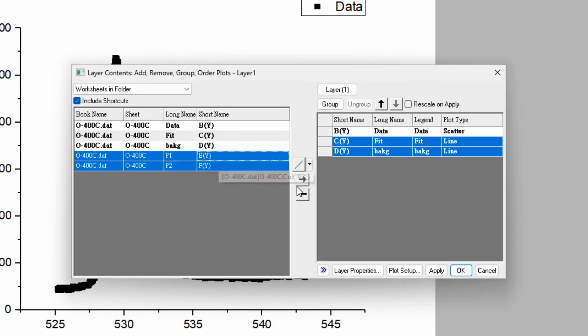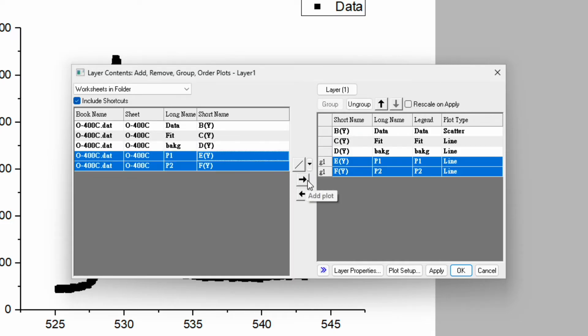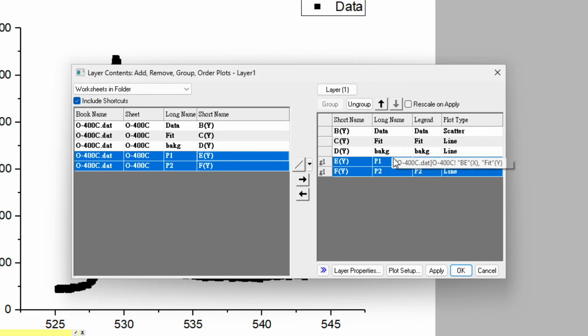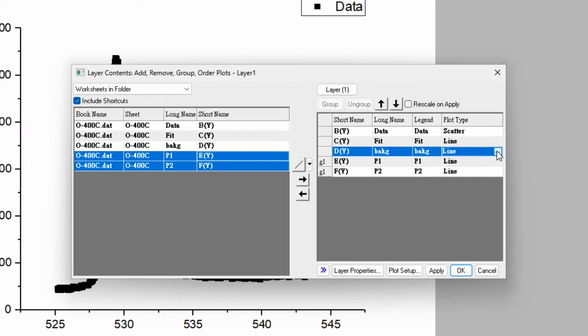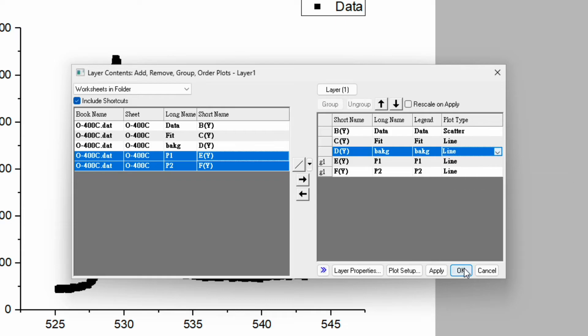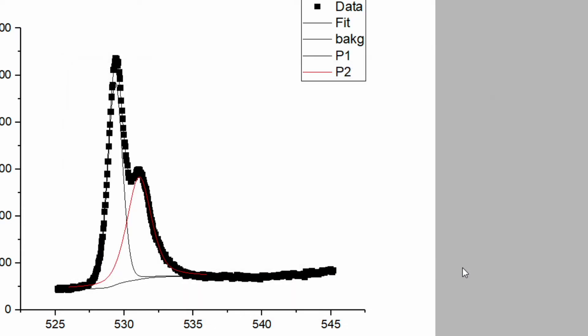And select these two and do the same again. So here we want to group P1 and P2, whereas keep background, fitting data as independent. If you click over here you can also change the pattern: line to scatter or line symbol. So right now just keep as a line and click on OK.